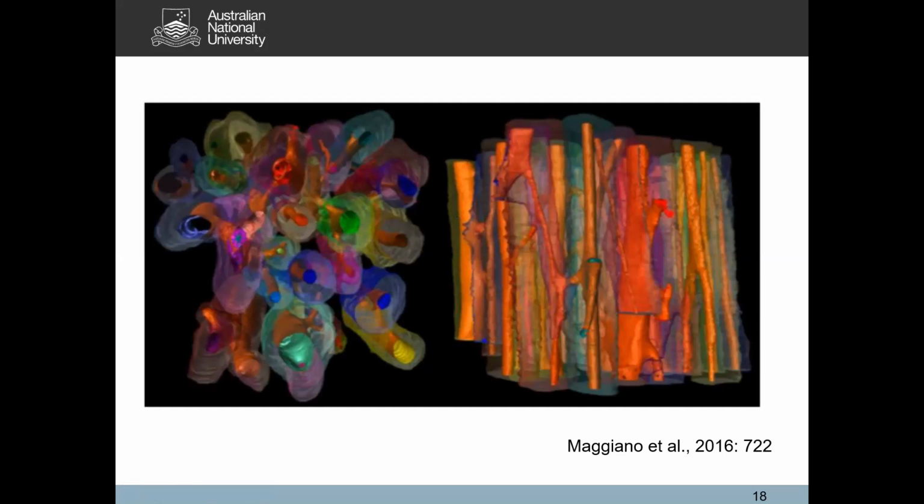So ideally, which means you have to spend a bit more time doing it, you'd be taking serial sections, so you can take one up here, one here, one here, or use a micro CT, pop your samples in a micro CT, which in terms of infrastructure, obviously is not always possible.